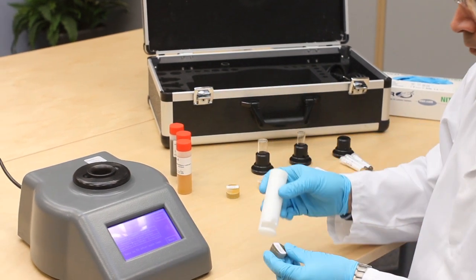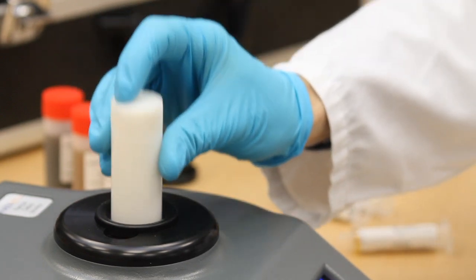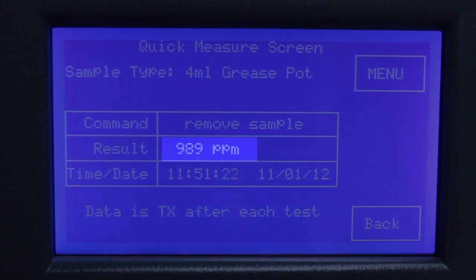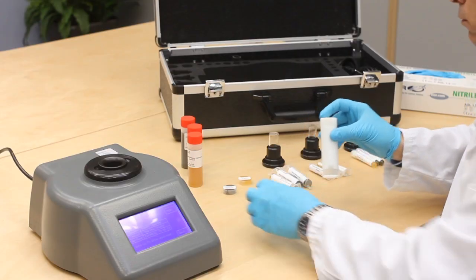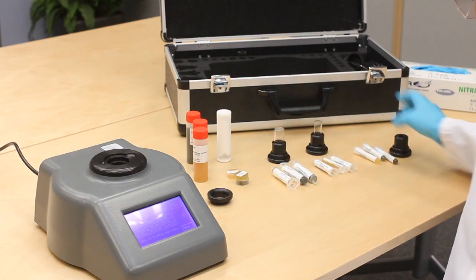A simple touchscreen interface guides the user through the procedure, instantly giving a metallic particle concentration of the sample in parts per million. Multiple adapters are supplied for various sizes of oil and grease samples.